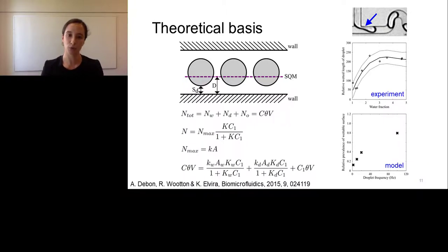So then we have 2 graphs there on the right-hand side of the slide. And what it shows here is the experimental results. So we made a microfluidic device that had a dripping mode, and we characterized how long it took to form the dripping mode and how many droplets we could put through our system. And then we did the same with the model. And the model, I know, has only 4 data points. That's because it was very intensive to run. But you can see that the same type of effect happens. You've got a steep increase at the beginning and then a plateau.